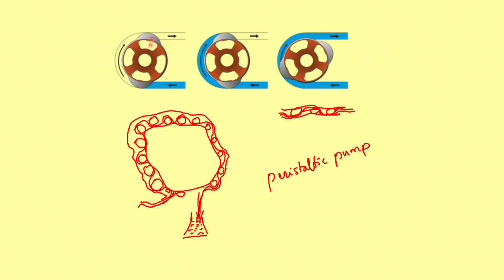For example, in the first figure on the top, you can see that the sample is moving here, it gets squeezed between this ball bearing and the outer tubing, and then the liquid gets sucked, and as this ball bearing moves, the liquid will be sucked inside and then it will be flowing through.